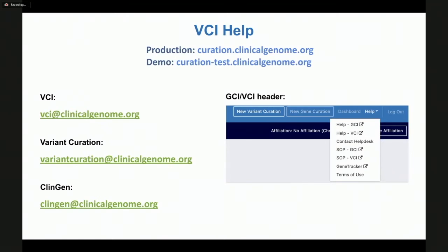In terms of the future, definitely a lot of our plans involve support for bulk workflows, such as the CSpec. We also want to do what we call evidence specification. So there would be more of a programmatic link for curators to set up between the criteria evaluated and the evidence used. Right now, I think people are writing it down in the explanation, which is obviously very important, but this would allow for that to be programmatically linked. For example, if you were evaluating a population criteria, you could indicate what data set within gnomAD or whatever your favorite population data set is that you were using.